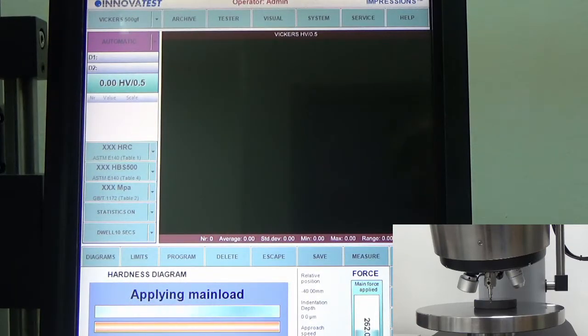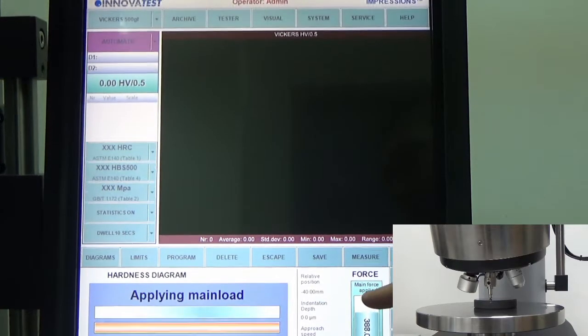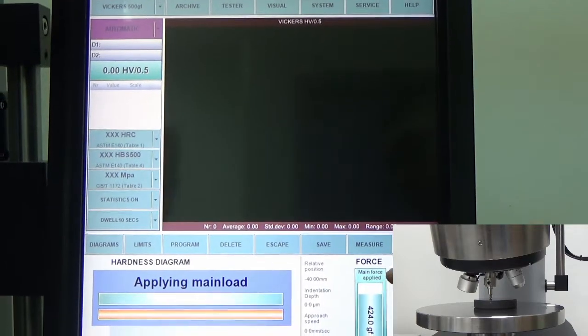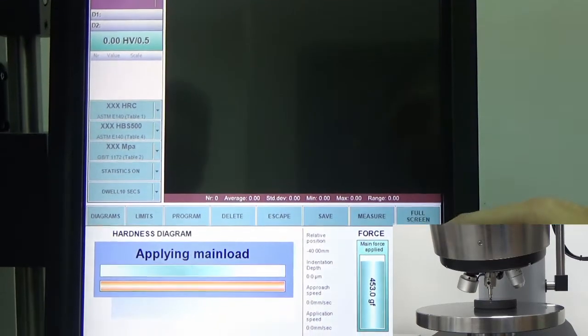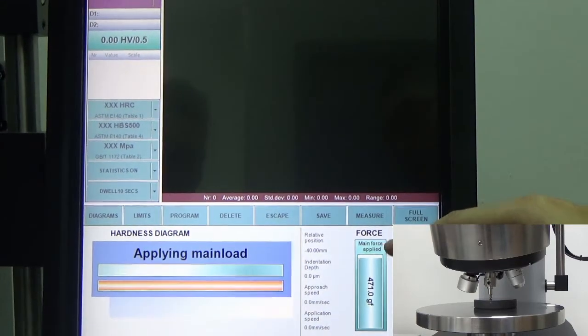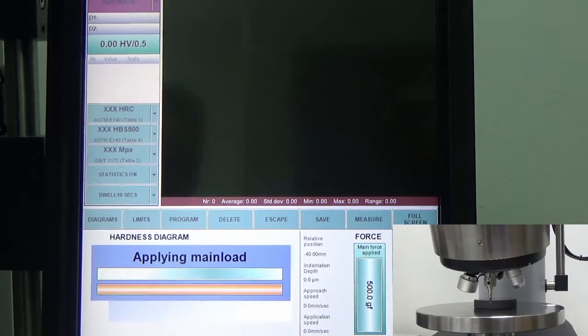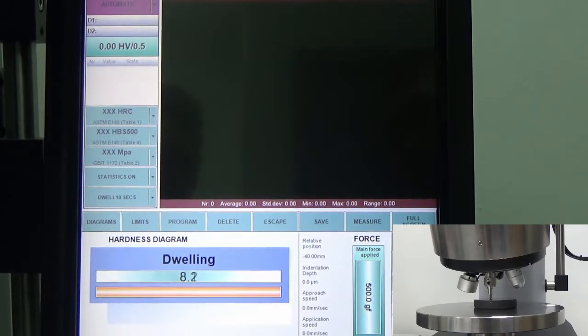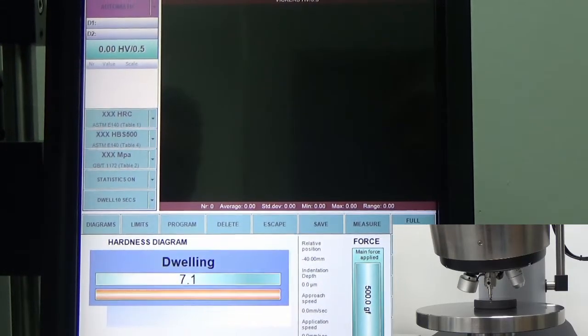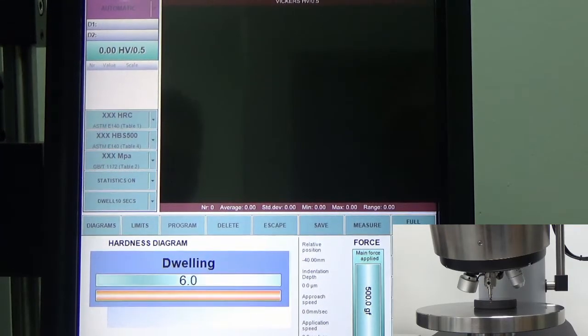As you can see, the force is being applied over here, which is around 500 grams of force, and the dwell time is around 10 seconds.